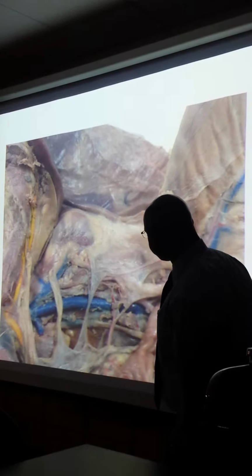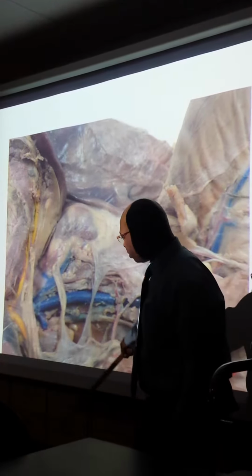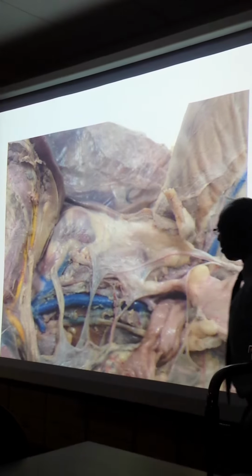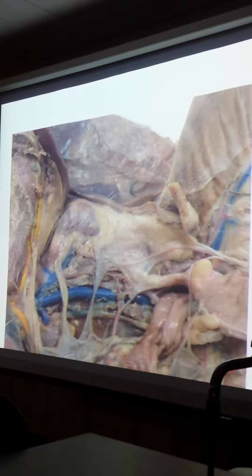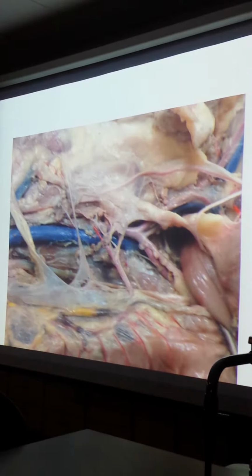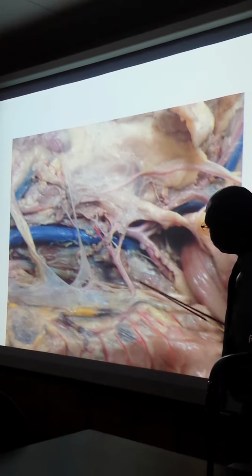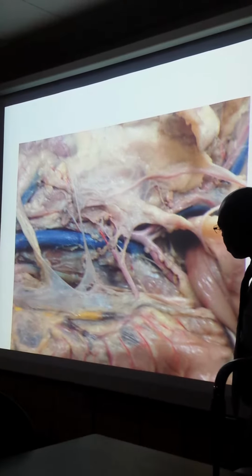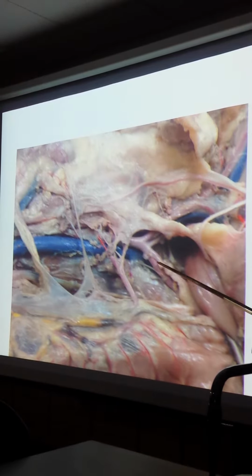Again, this is the inferior mesenteric artery. Of course, renal vein, right? This is the gastrosplenic, and this kind of goes to the spleen. The superior mesenteric, but it's kind of cut off a little bit. Again, better pictures coming up. This is beginning to show a little bit more what's going on down here. And of course, this is on the lower part, so this is the inferior mesenteric artery again, and spermatic and so forth, and of course external iliac.